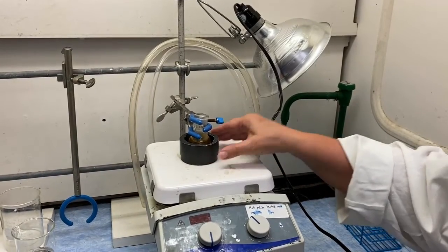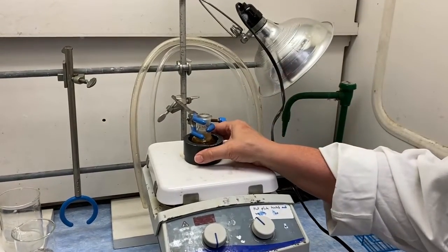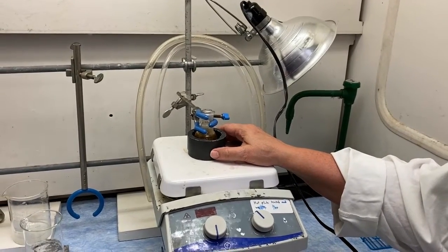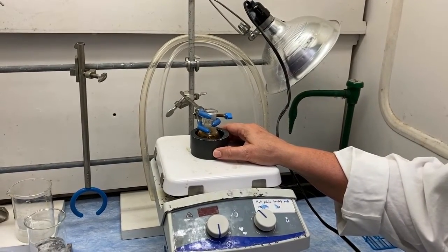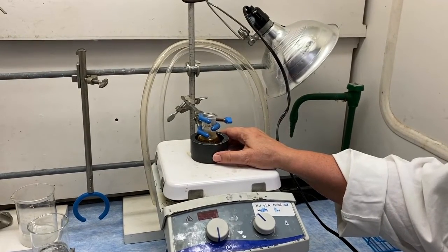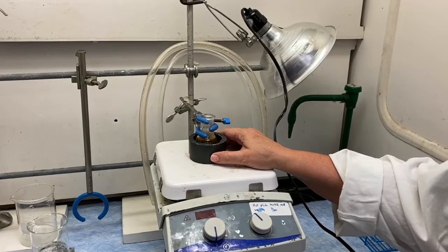This is the second product that we've made, but we're not going to isolate this product because of the difficulties in the isolation. We're going to let this stir for about 5 minutes, and then we're going to acylate this. Once we acylate this, we're going to form an amide.